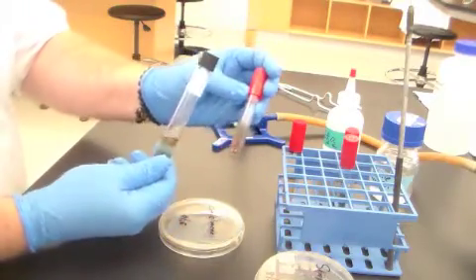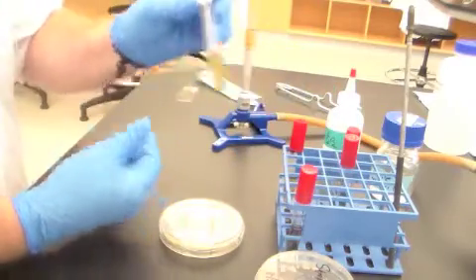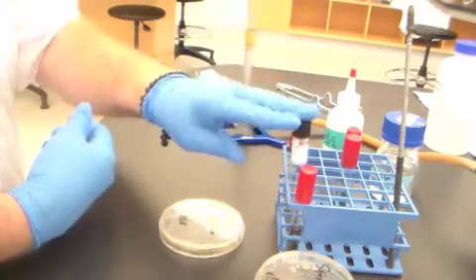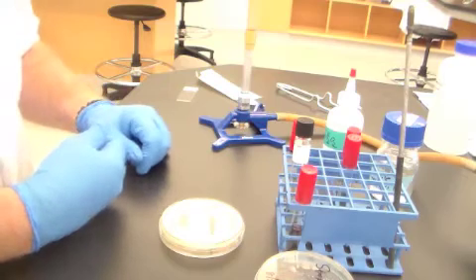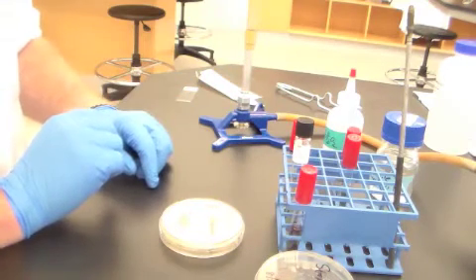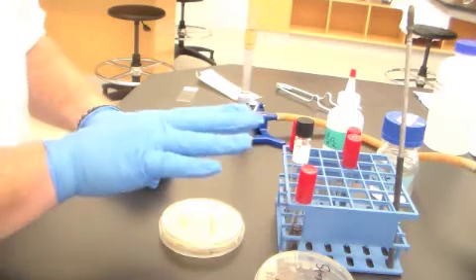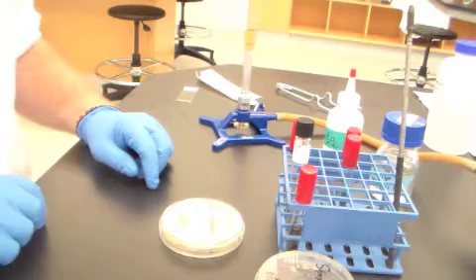In this particular case, it's easy to tell, but it may not be in your case. So very important that you label these.